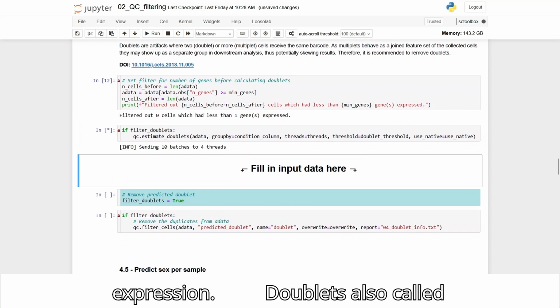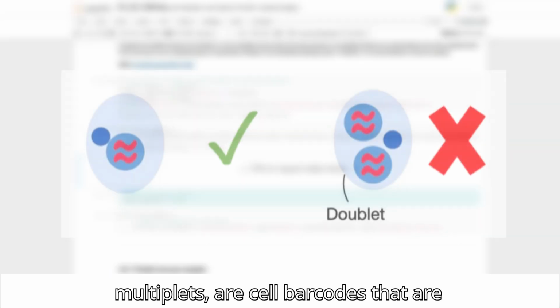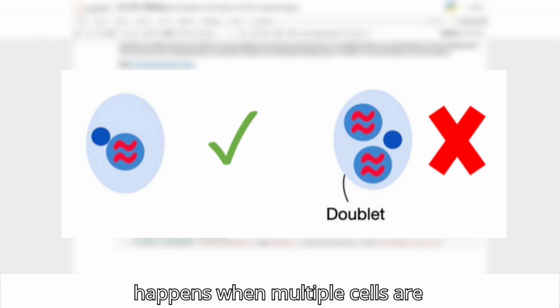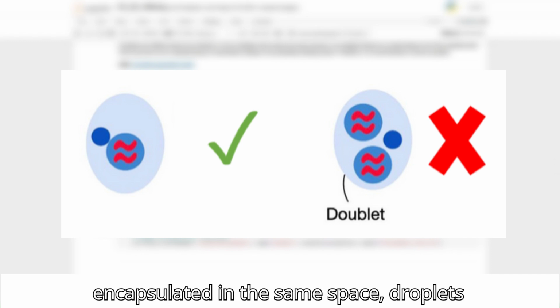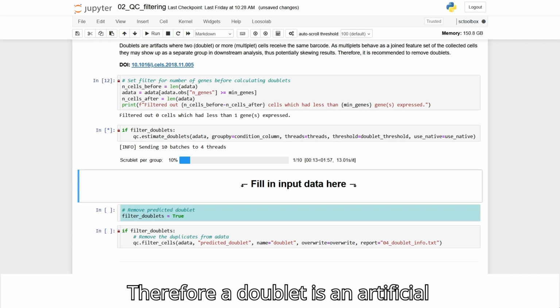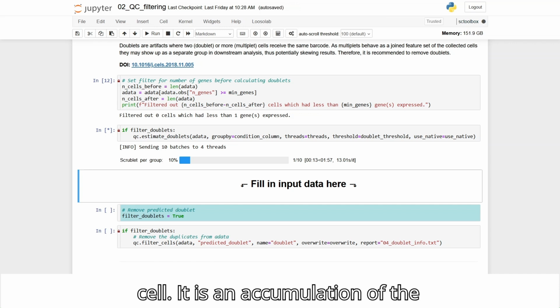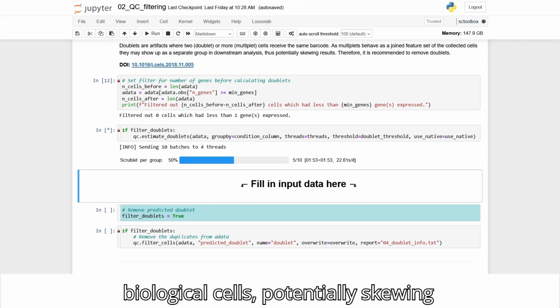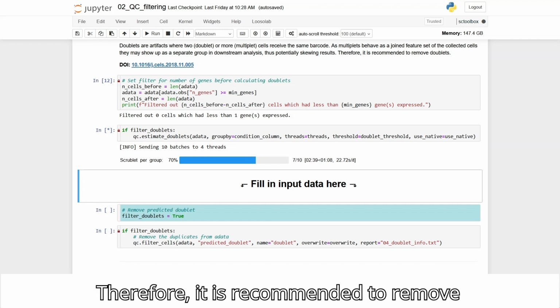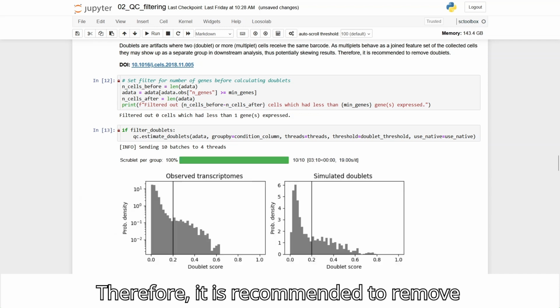Doublets, also called multiplets, are cell barcodes that are assigned to 2 or more cells. This happens when multiple cells are encapsulated in the same space, droplets or wells, during the separation stage. Therefore, a doublet is an artificial cell. It is an accumulation of the expression profiles of multiple biological cells, potentially skewing results due to high read counts. Therefore, it is recommended to remove doublets.